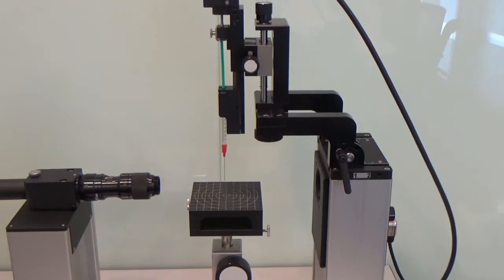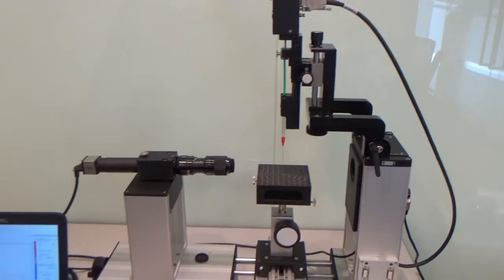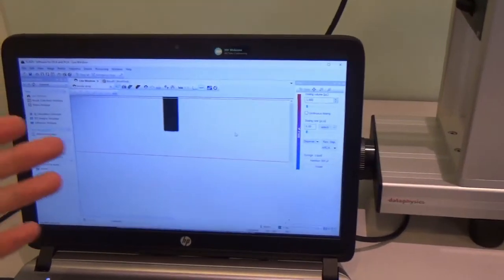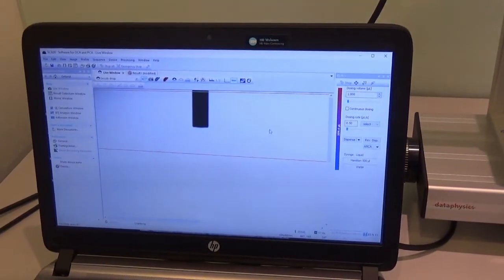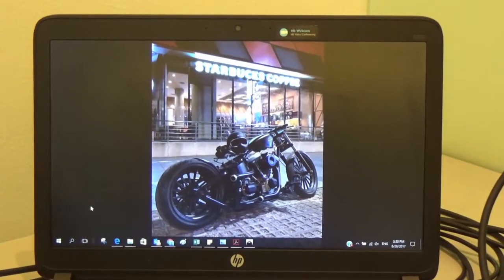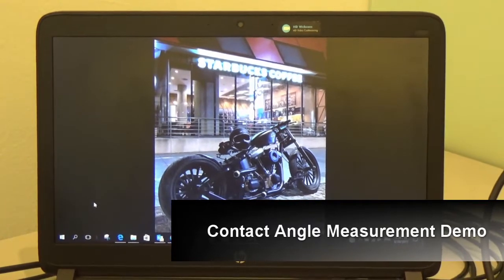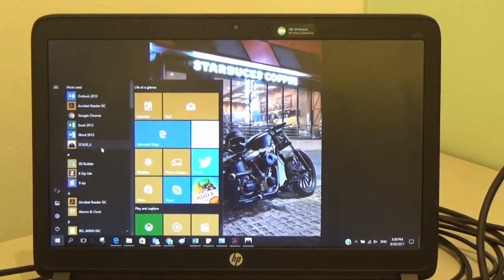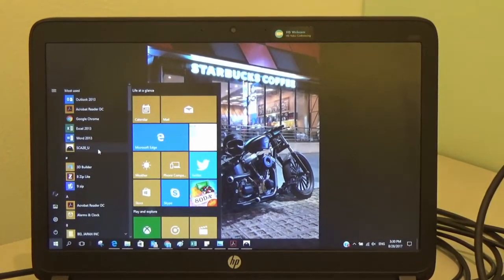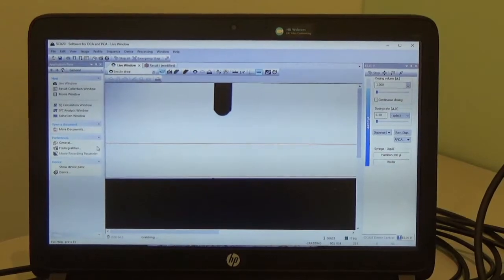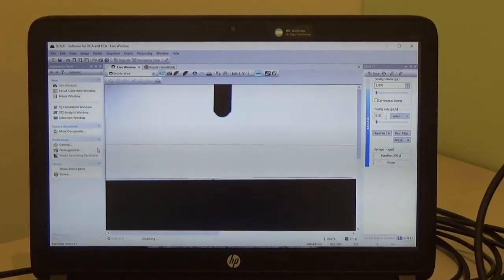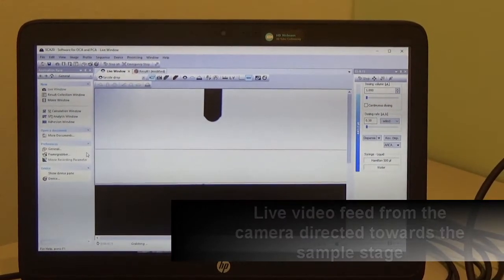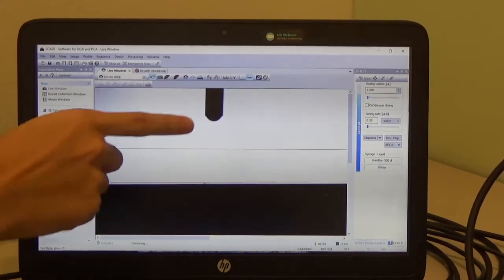The whole system measurement is done and controlled through the software, as shown on this laptop. Now we are going to do a contact angle measurement using this OCA25. First, you have to start the software and you will immediately see a live window showing a real-time feed of the syringe.